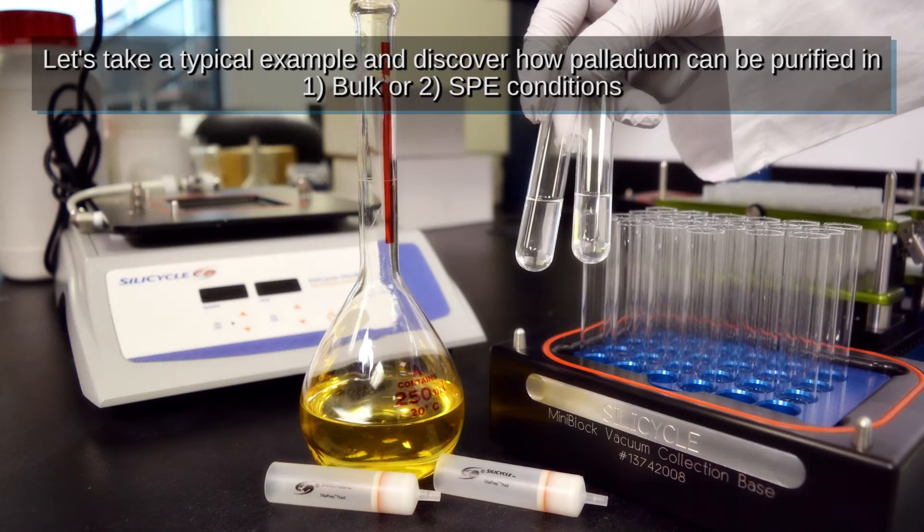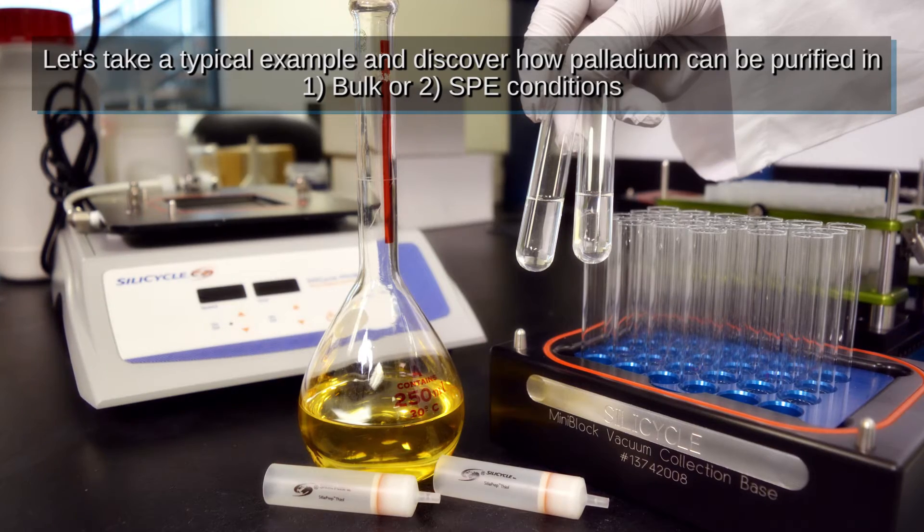Let's take a typical example and discover how palladium can be purified in either bulk or SPE conditions.